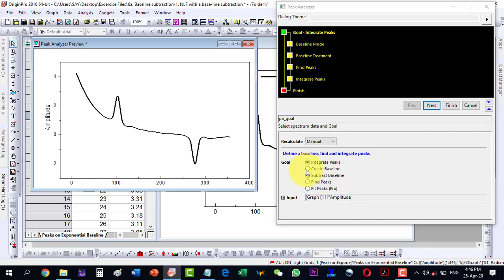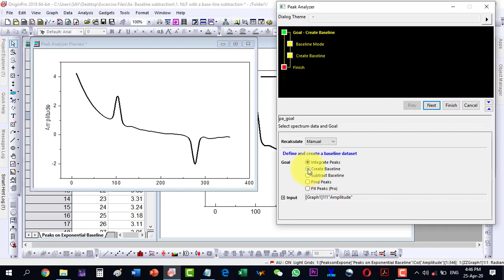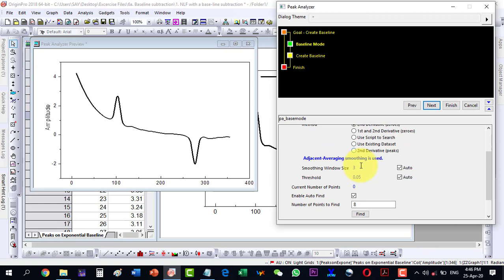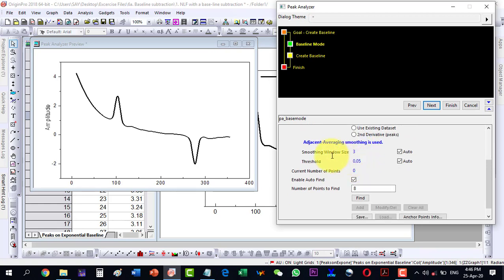First we will create a baseline, then in the next step we will subtract a baseline directly. Select 'Create a Baseline' and click Next. The baseline mode is User Defined, and the method is Second Derivatives for calculation of zeros. There are other methods available, but we will proceed with the Second Derivatives method.